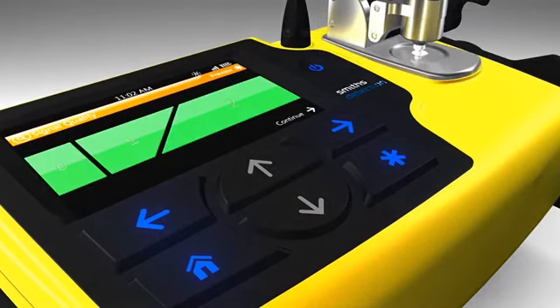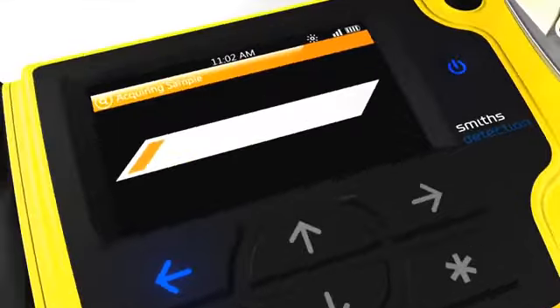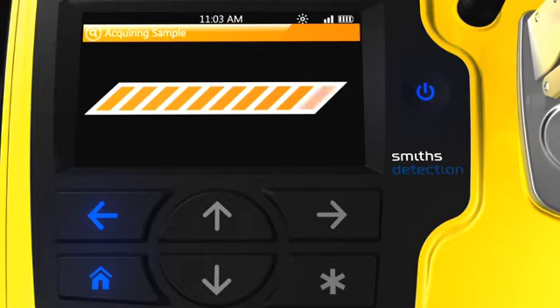The analysis time on this device is fixed by the user and will never take an unexpectedly long time. This is in contrast to the approach taken in other handheld FTIR devices, where the analysis time can take tens of minutes or even hours, depending on the user's level of expertise. The new HazMatID is designed such that users of all experience levels can always get accurate results in less than 1 minute.